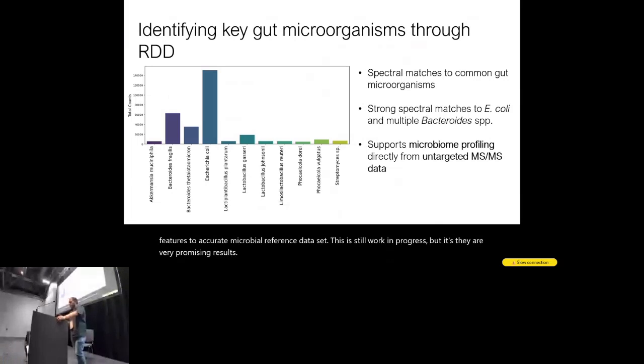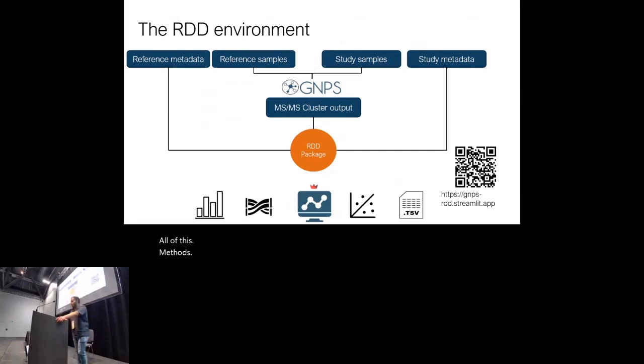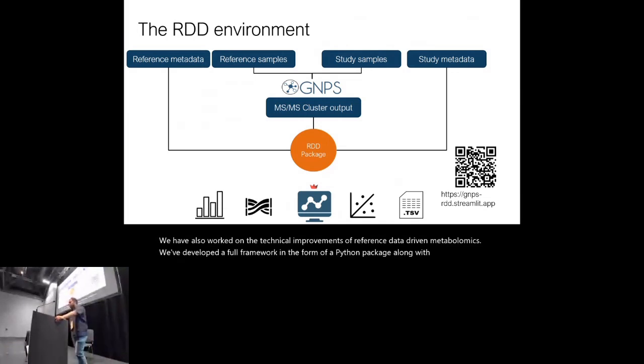To support all of this, we have also worked on technical improvements of reference data-driven metabolomics. We've developed a full framework in the form of a Python package, along with a web Streamlit application to support fast and flexible analysis using RDD.